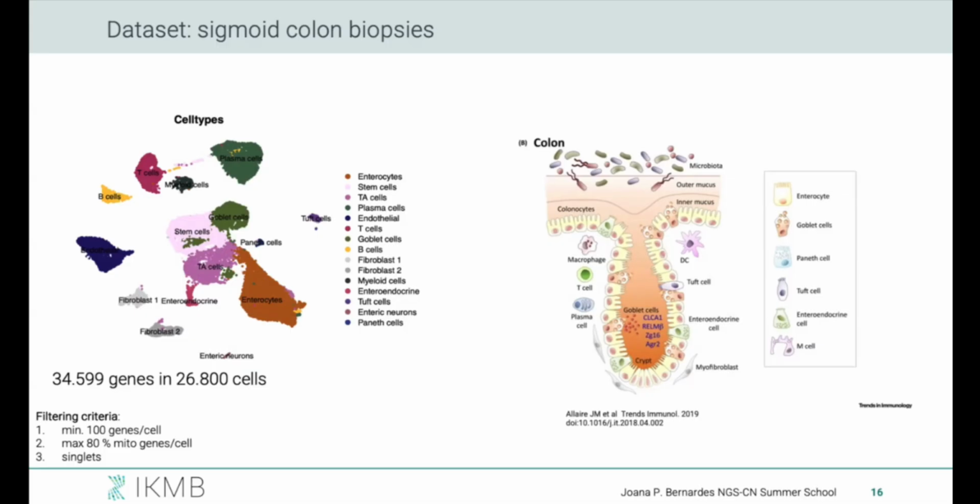In this case, we were still not as good as I just mentioned. We were able to identify 26,000, so almost 27,000 cells here. These are all done with 3' protocols from 10x. There's also a bit of multiplexing in this, but I will mention it another time. On the left side, I already did the cell type annotation, which is of course crucial. You can already separate pretty well these immune clusters from the epithelium clusters, and from the endothelium and lymphatic clusters. So I'm pretty happy with this cell annotation.